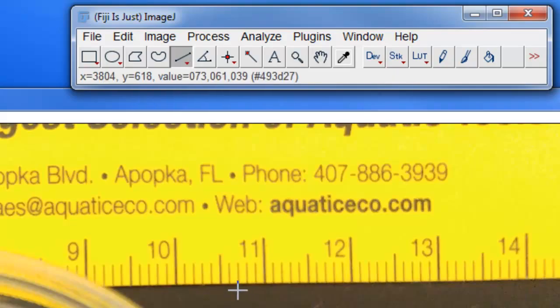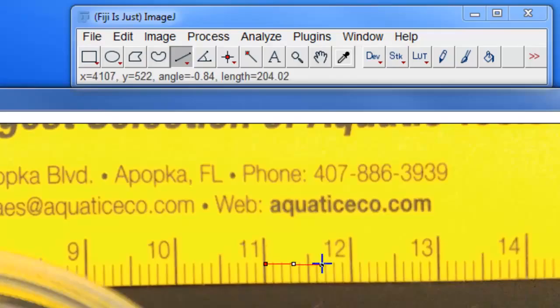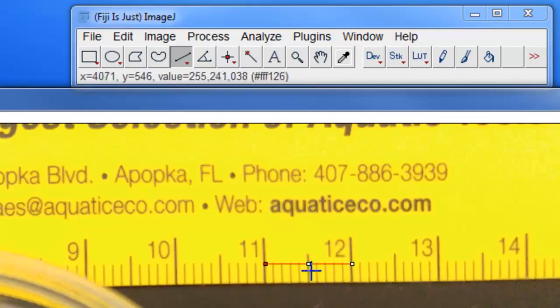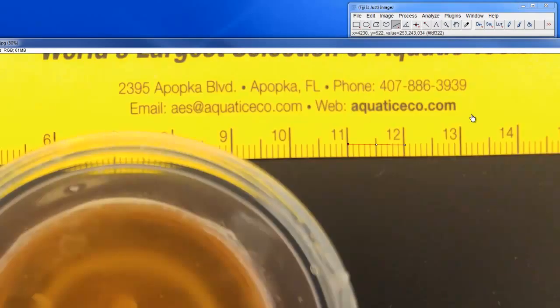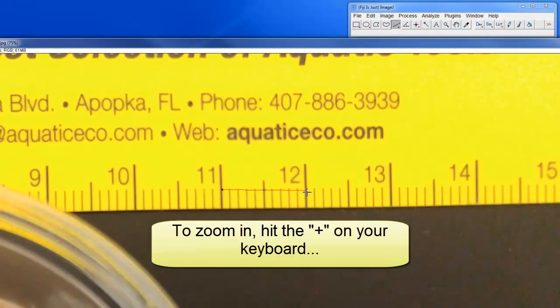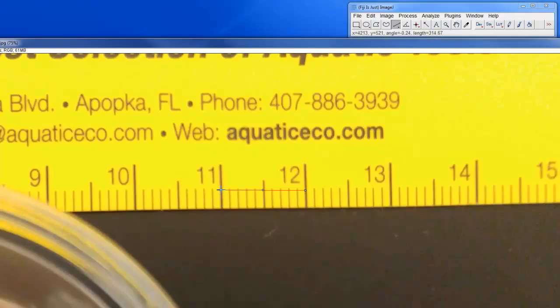I'm going to take the straight line tool and click and drag it a known distance — in my example, 10 millimeters. You can go longer or shorter as long as you know the distance, but the longer the better. I'll drag it back just a bit — that looks pretty good. If you want to get really precise, hit the plus button to zoom in. I can see I can do a little better, so I'll drag this back just a little. The more accurate you do this, the more accurate your results.